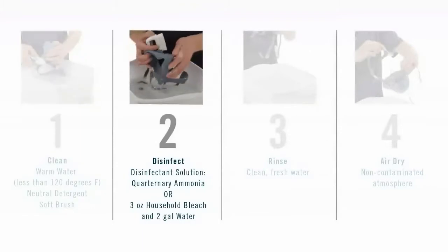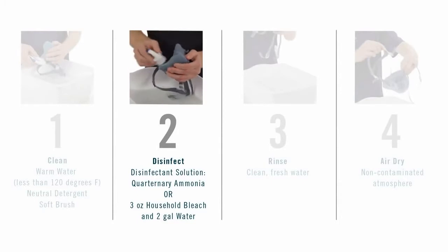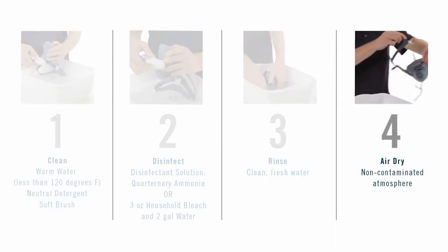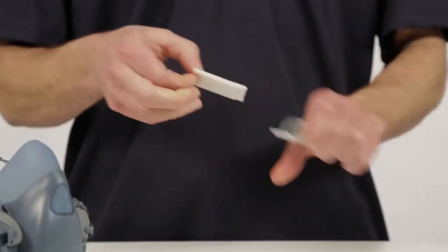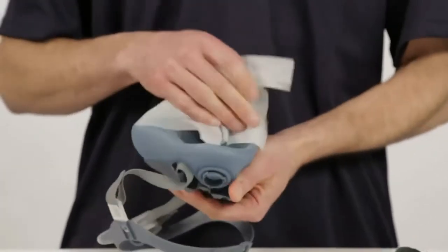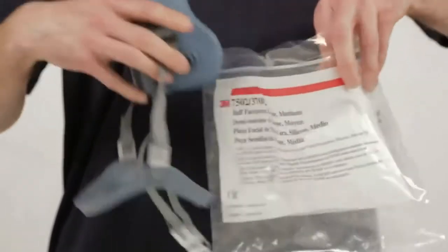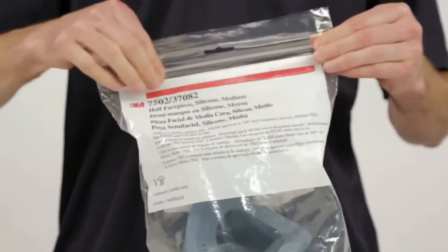Disinfect the facepiece by soaking it in a solution of quaternary ammonia disinfectant or sodium hypochlorite or other disinfectant. Rinse the facepiece in fresh, warm water and air dry in a non-contaminated atmosphere. 3M respirator wipes may be used as an interim method in the cleaning schedule for individually assigned respirators, but they must not be the only method in place. When not in use, store your respirator in its resealable storage bag or other suitable storage container away from the contaminated areas.